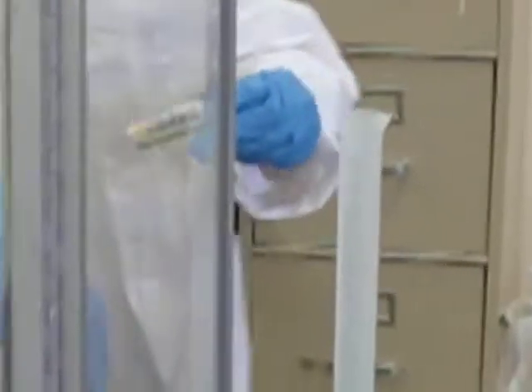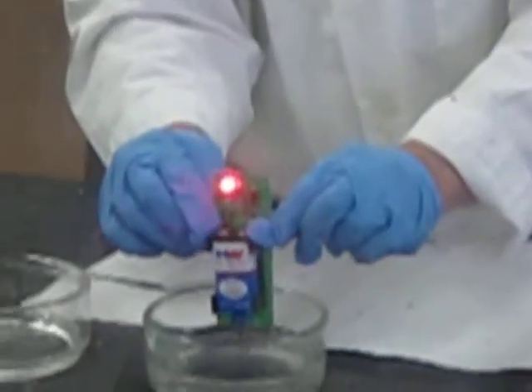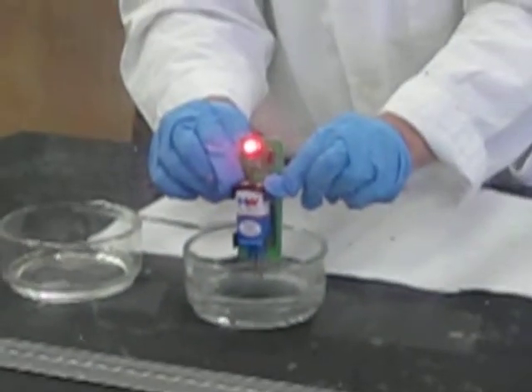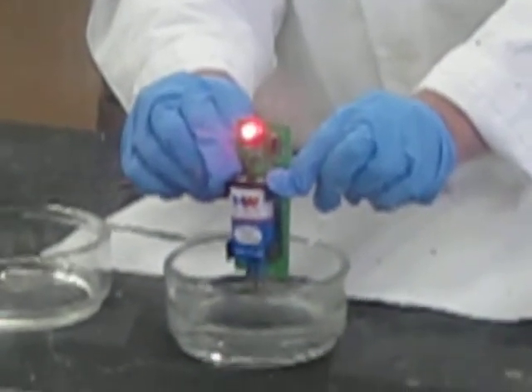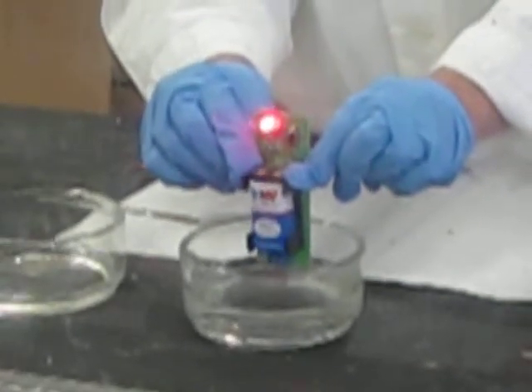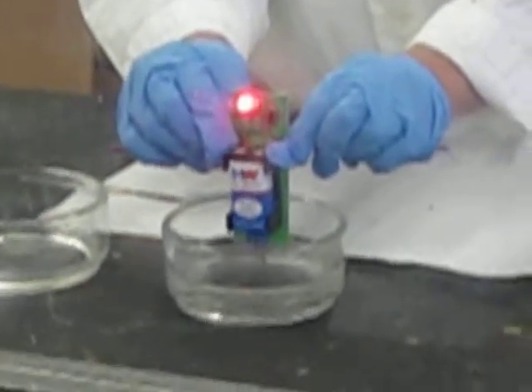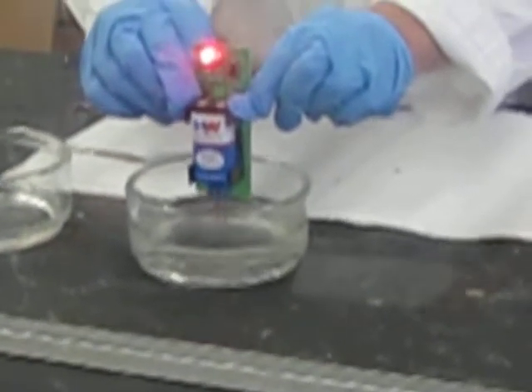Awesome. And finally, we're going to look at our conductivity. Remember, it was low conductivity. Now, what do the lights do? Extremely bright, and is the green one on? A little bit, yeah. Okay, so now we went from low conductivity to very high conductivity. Low to very high. Excellent.